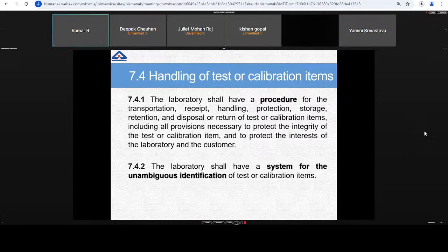That is also possible. So what is our retention policy? Mostly our policy must fulfill the requirements of our customer and regulatory requirements. As per that time, the sample must be retained. Even during that time, the integrity of the sample must be maintained. For that, whatever storage conditions are needed must be provided, and that should be monitored.